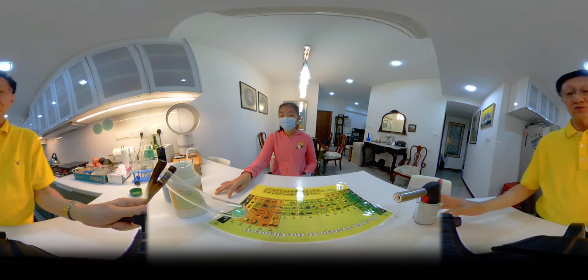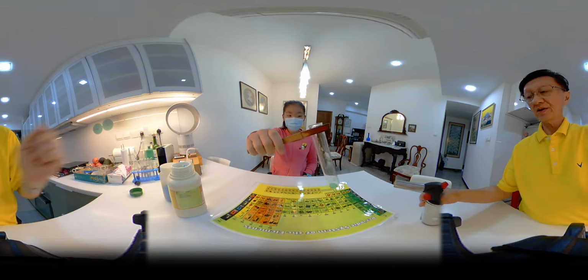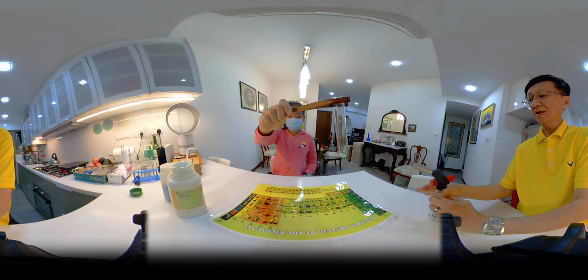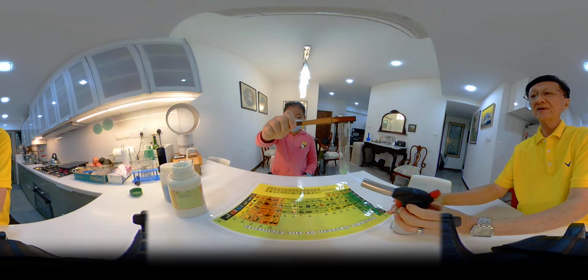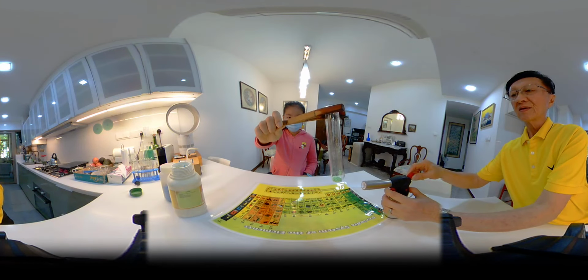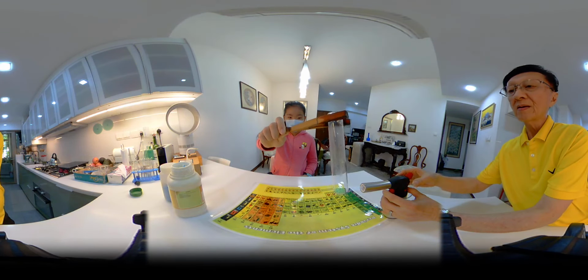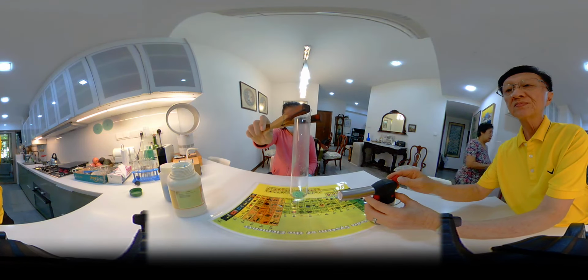Now what I'm going to do is I'm going to heat this. Oh, okay. So I'm going to heat this. I'm going to put it higher. And what color is it going to turn into?